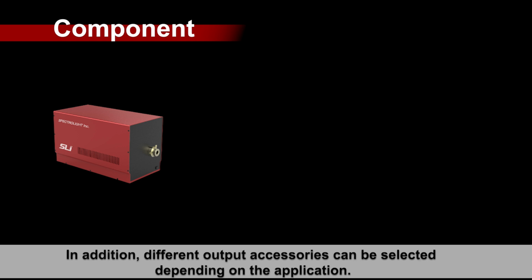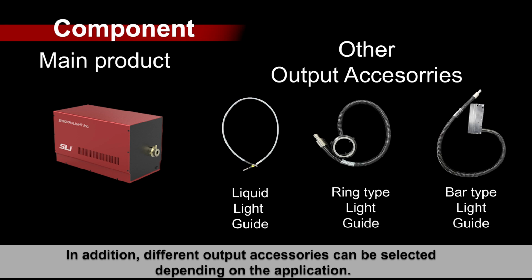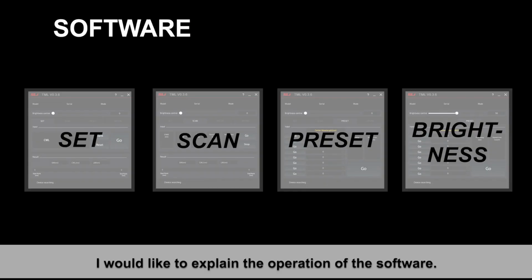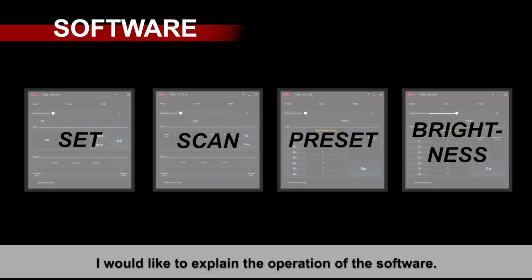In addition, different output accessories can be selected depending on the application. In particular, when a liquid light guide is connected to a microscope, it can be used as a light source for a fluorescence microscope. I would like to explain the operation of the software.